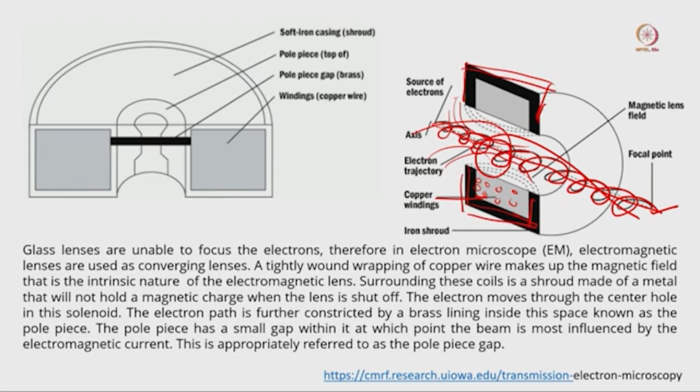In the old days, 10 or 15 years ago, we generally kept the electron microscope in a very dark room. At that time we were using a CCD camera, and inside that dark room, during actual imaging, people were not allowed to go in and out all the time, because that creates vibration, which affects our imaging. Also, too much temperature change affects our electromagnetic lens systems. So during imaging we should not go in and out all the time.